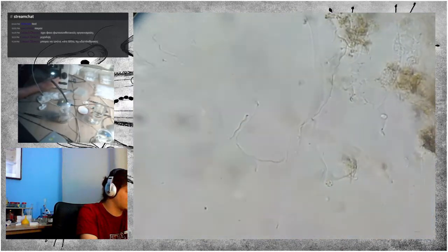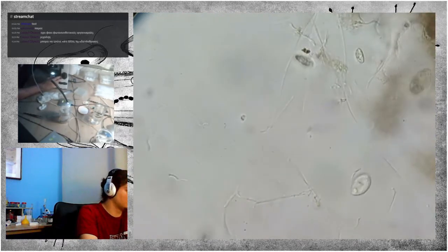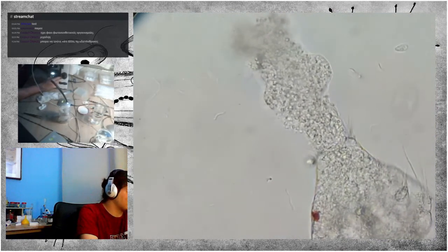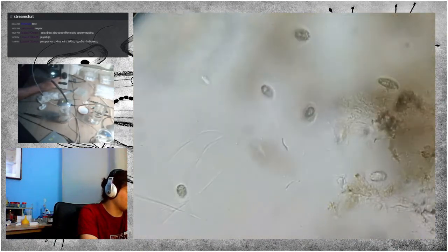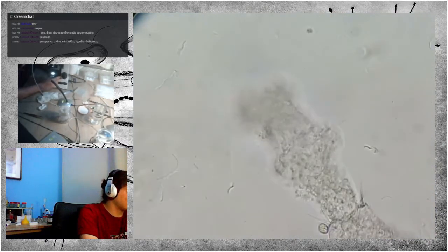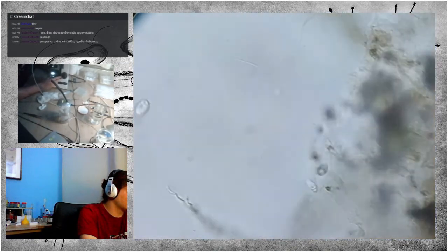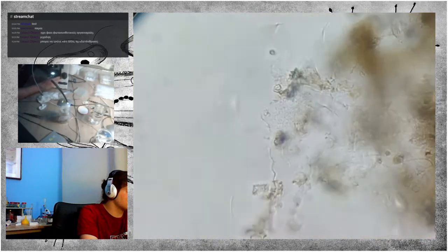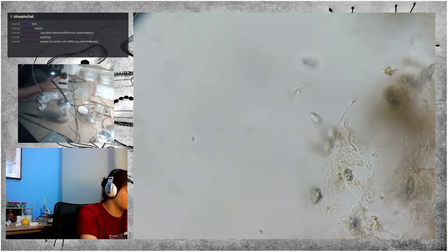Now, a problem with microscopy, as you may have seen, is that any small movements make the slide and the water in the slide tremble and vibrate, which obviously lowers the experience quality, but sometimes it makes it difficult to observe things because they might move, or you might lose them, especially in higher magnification.